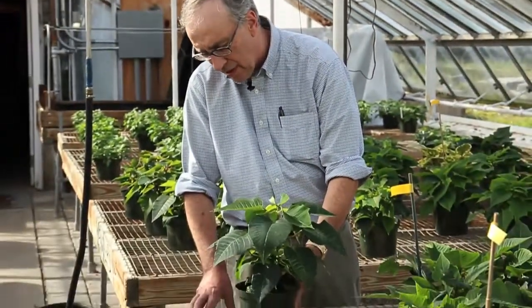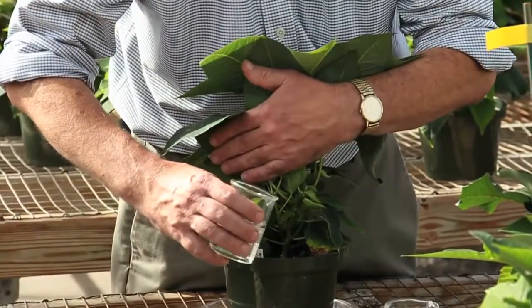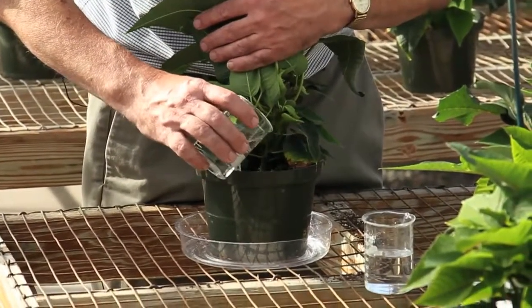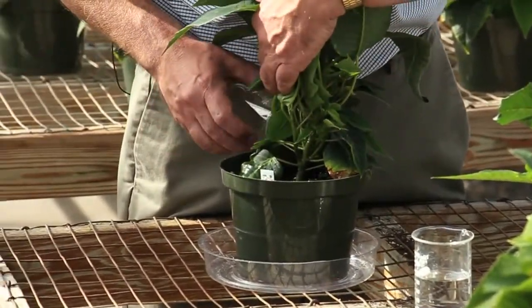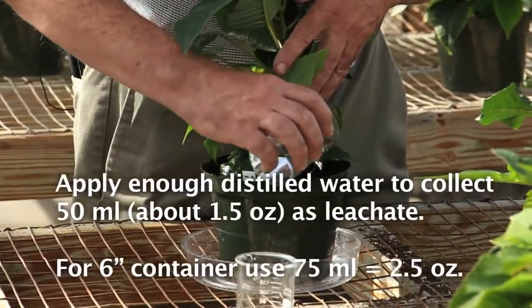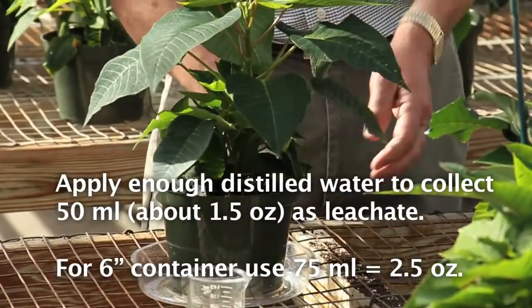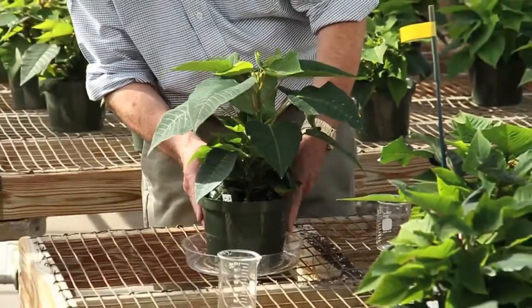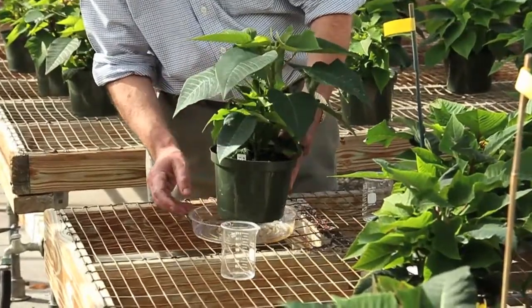At the end of the hour, you take the pot and place it in a plastic saucer, then apply distilled water to the top. You want to apply enough so that you can collect 50 milliliters from the bottom of the pot. For a six-inch pot like this one, it takes about two and a half fluid ounces of water to irrigate it to the point where it begins to leach out, and then you can expect to collect 50 milliliters.